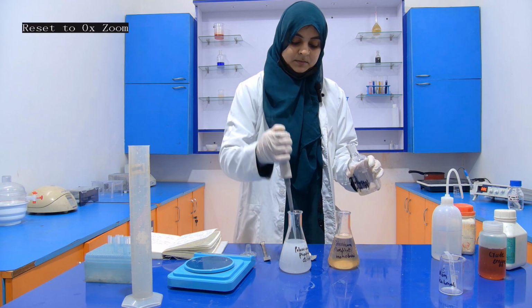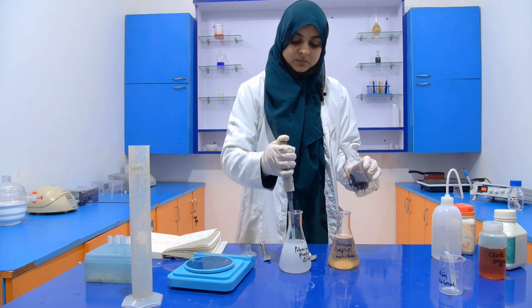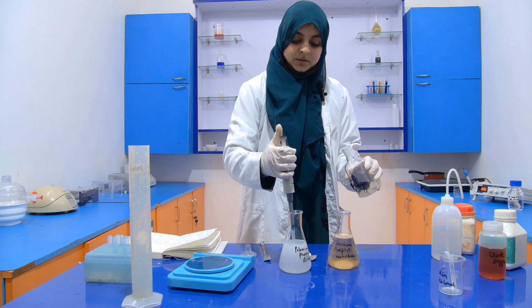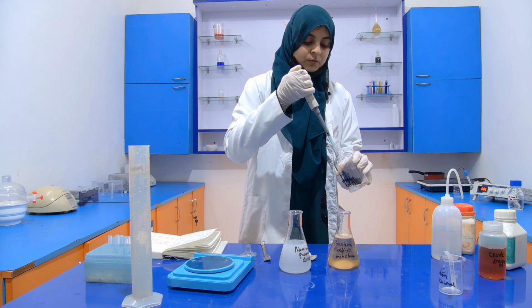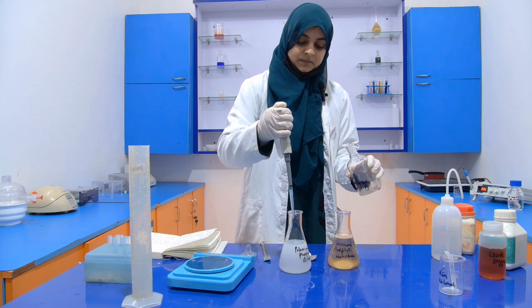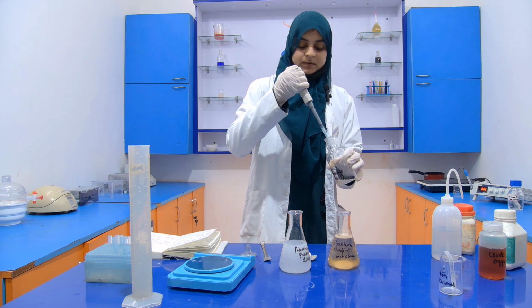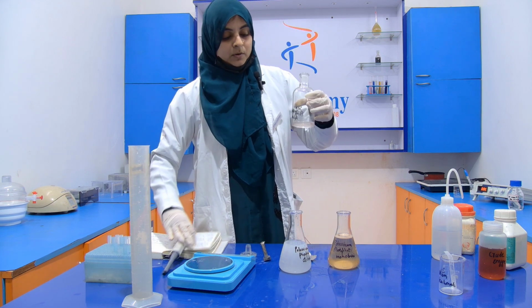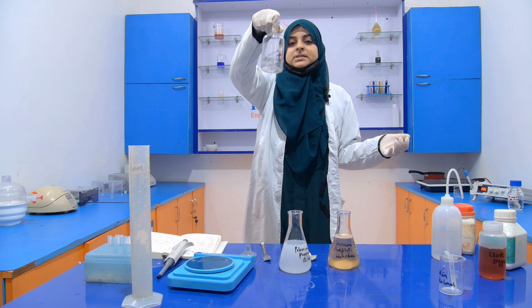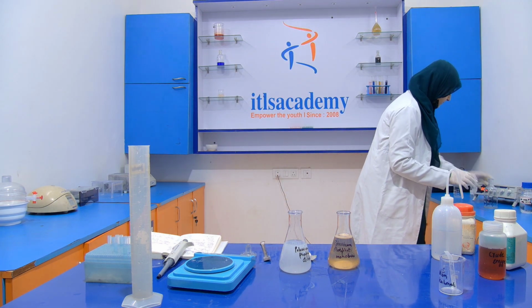1, 2, 3, 4, and 5. So 10 ml we take. Now I am going to maintain its pH at 7 with the help of the pH meter.